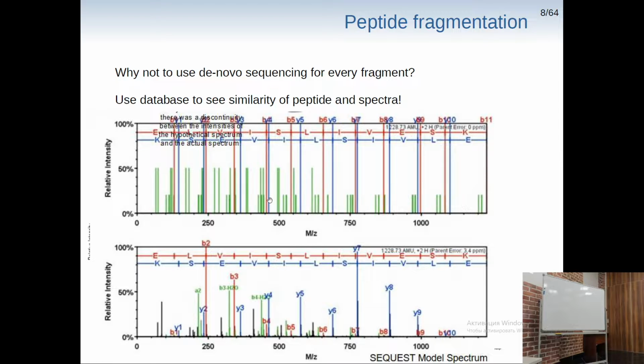Of course, it is possible to search just for spectra, but just imagine the number of spectra you would have to make for any organism to compare those spectra side by side. The size of this database would be enormous, but you can generate those in silico spectra on the fly, right?